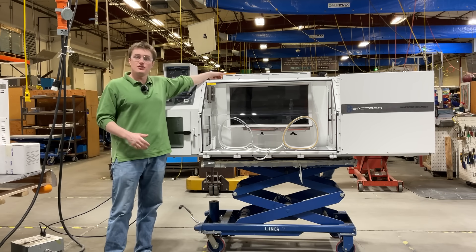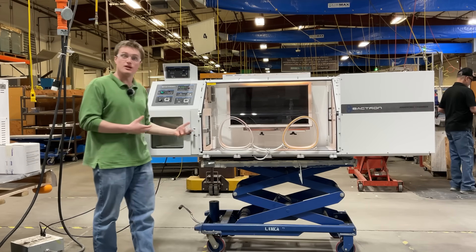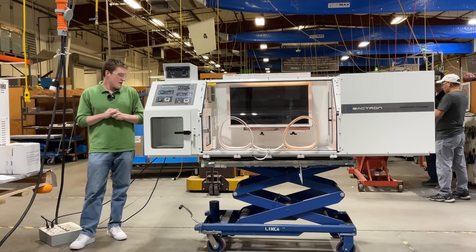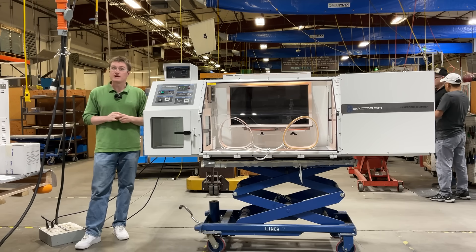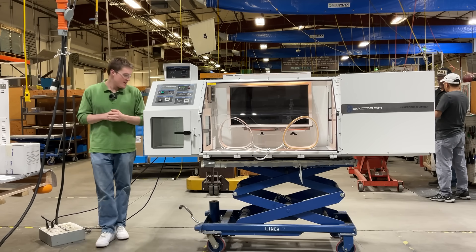Each unit is included with a light switch, which allows you to illuminate the inside of your workspace should you want to. Whether you're conducting clinical diagnostics, pharmaceutical testing, food safety testing, or industrial microbiology, investing in the Bactron 900 is a strategic decision that enhances laboratory efficiency, efficacy, and workflow.